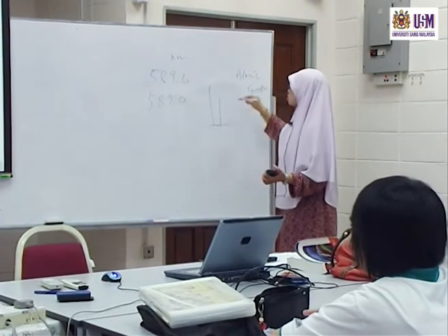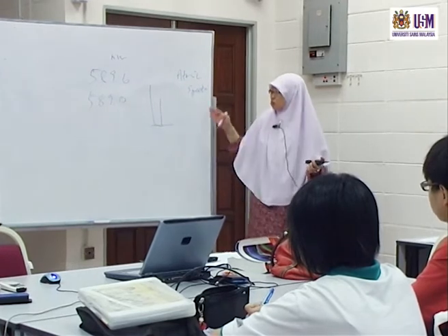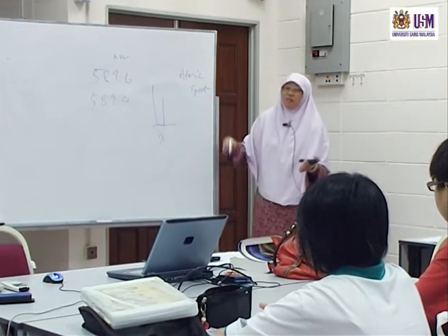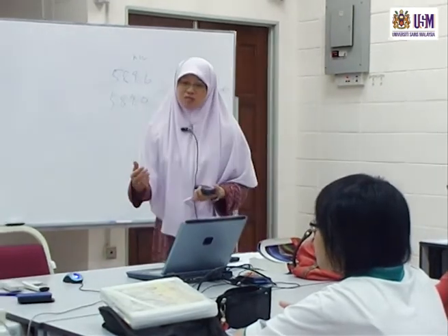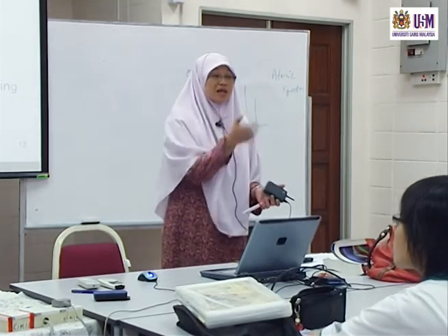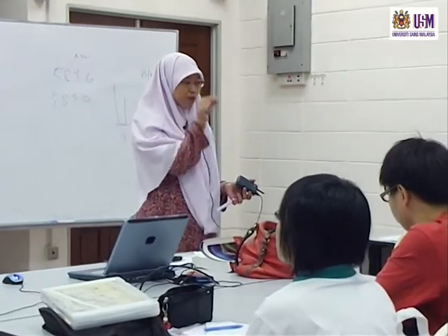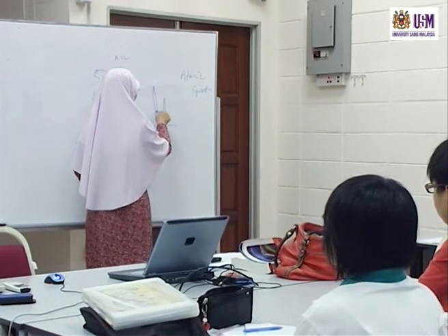If you were to visualize an atomic absorption spectrum, spectra means many, and a spectrum is one. You talk about energy being absorbed, or maybe emission. You show absorption lines or emission lines versus wavelength. In this case, you should see lines which have specific wavelengths. However, last time when we discussed the instrument, we said that because of the slit width you have an effective bandwidth. So you never have a true line, but a line with an effective bandwidth because of the slit.